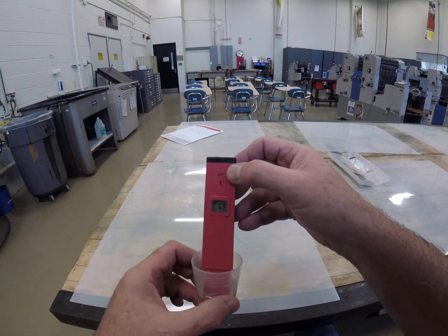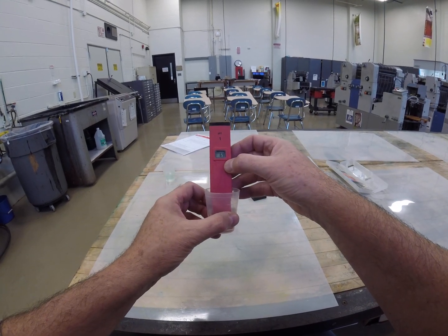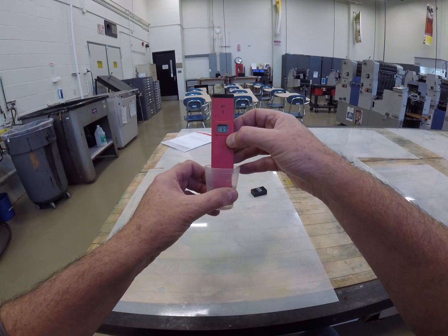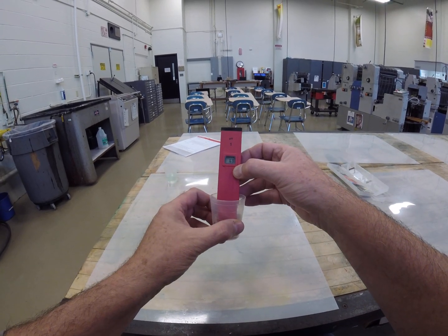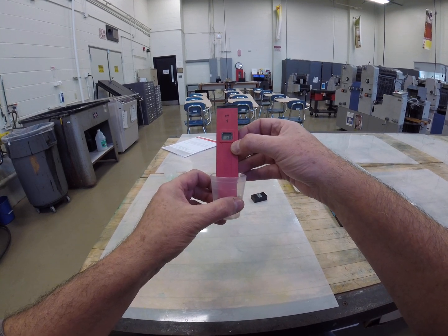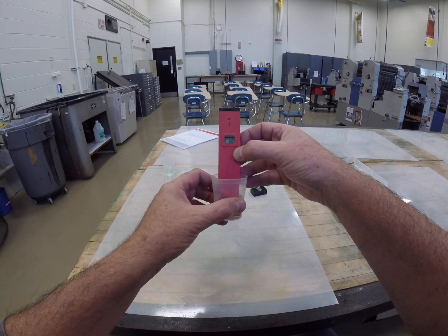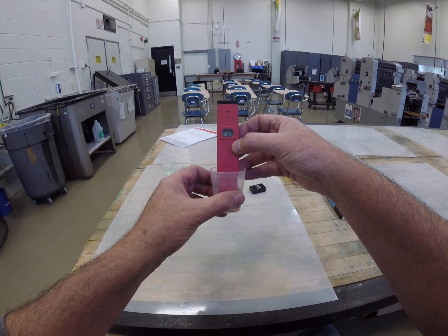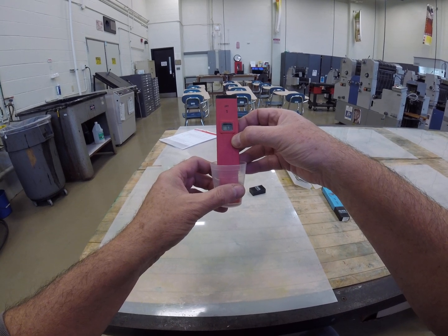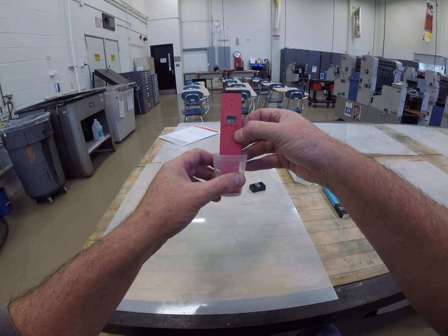The value is 7.0, fluctuating a little bit from 6.9 to 7.1. That's regular faucet tap water, and a pH of 7 is considered to be neutral. Anything below 7 — from 0 to 7 — would be an acid, and anything above 7 — from 7.1 to 14, which is the maximum — would be considered alkaline or a base.